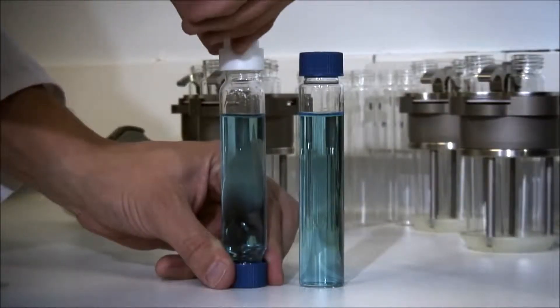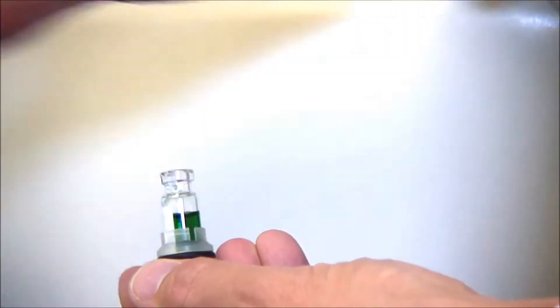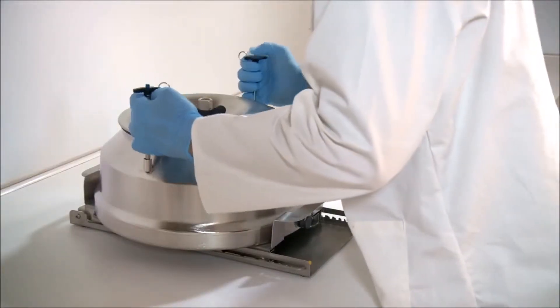special flip-flop tubes, and Genovac flasks, including Sample Genie, which enables large volumes to be dried or concentrated directly into a small vial.